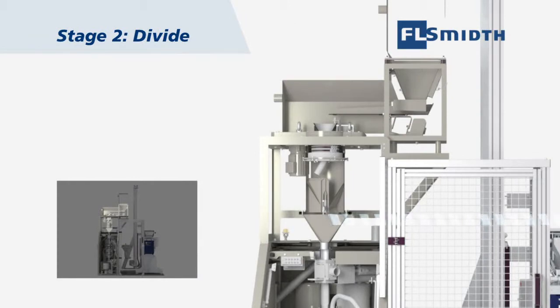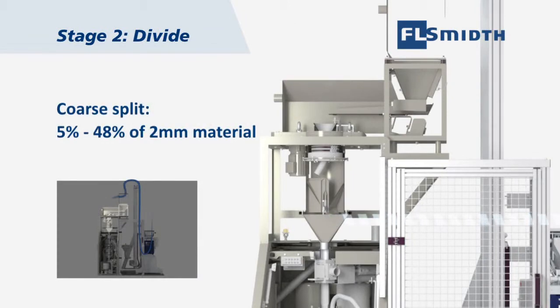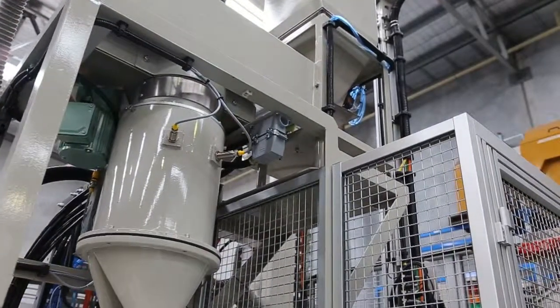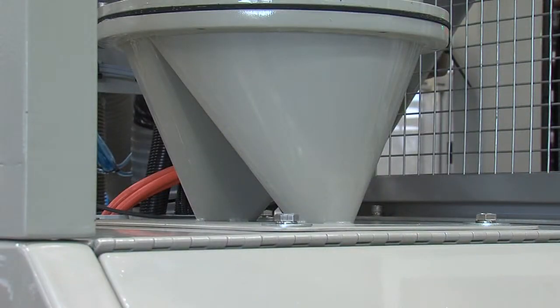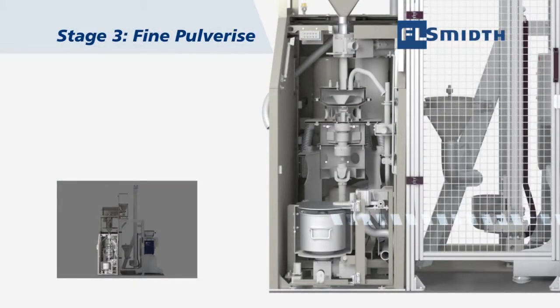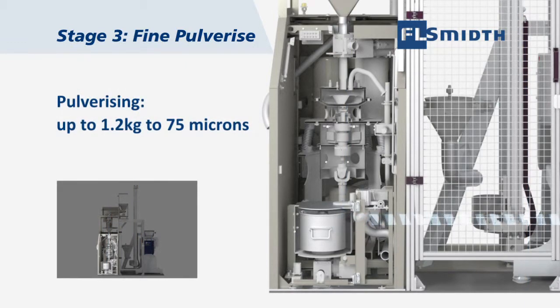The variable split rotary tube sampler delivers a coarse split of between 5% and 48% of 2 millimetre material. Mounting the splitter directly above the autobatch mill minimises sample transfer cross-contamination points. The ever-reliable ABM 200R mill fitted with a 2000cc bowl pulverises up to 1.2 kilograms to 75 micron.